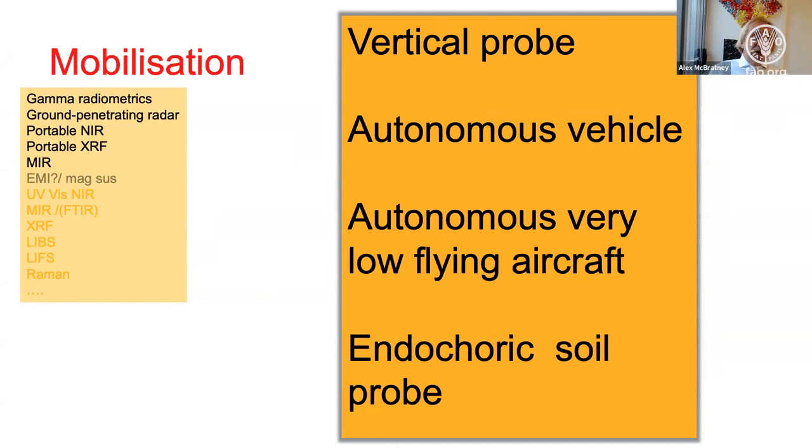And we could do it as an endochoric soil probe. Endochoric, which is a word I made up yesterday, means inside the volume of the soil itself. In other words, it operates inside the soil. So next slide.